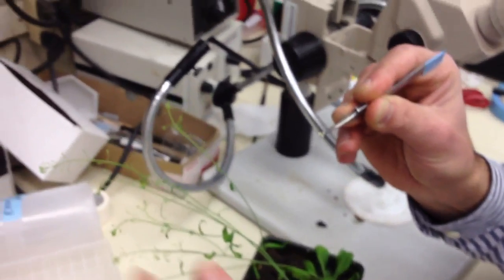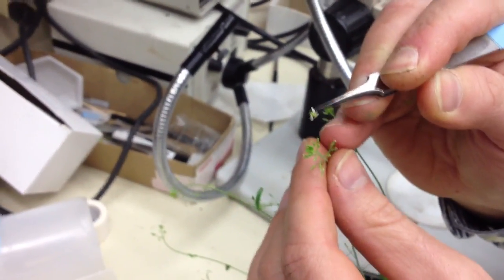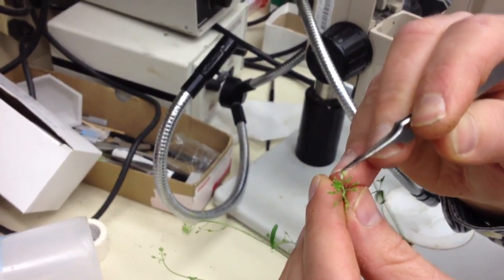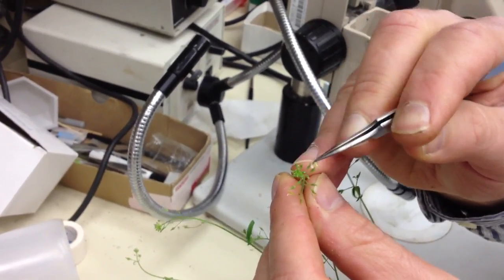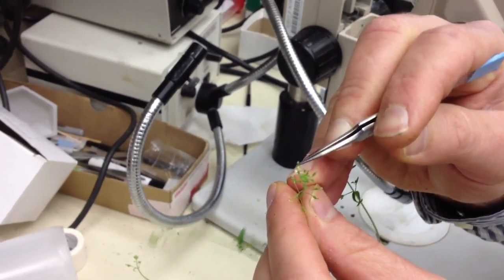He simply takes that flower, now held in the forceps, over to the recipient. In this case, the recipient is an AP3 mutant, and he will simply touch the male part of the flower — the stamens or the anther — to the female part of the recipient, the AP3 mutant, and hopefully some of that pollen will land on the carpel or the pistil and will affect fertilization.